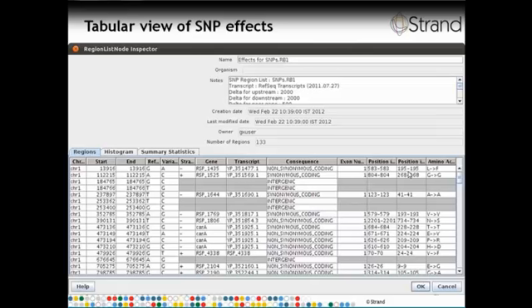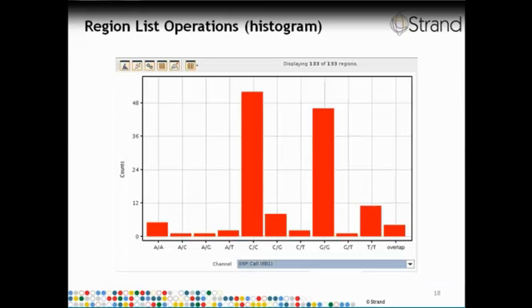One can also try to understand the score that has been generated by the MiSeq SNP analysis software. One would expect the score to be proportional to the total number of reads that is covering the reference location. So we can try to verify that by doing a scatter plot between the total number of reads spanning a reference location and the score that was assigned to the variant allele at that point. And we can see that there are two trends. There are a lot of SNPs for which the score is directly proportional to the total number of reads, but one also sees some outliers out here.